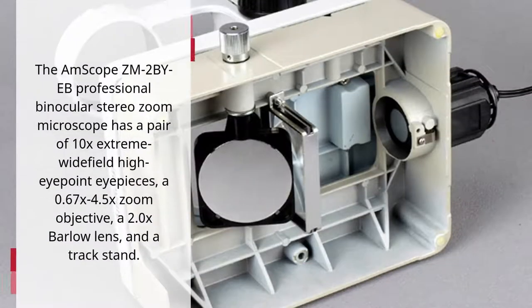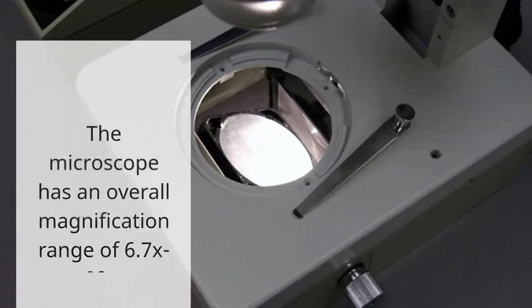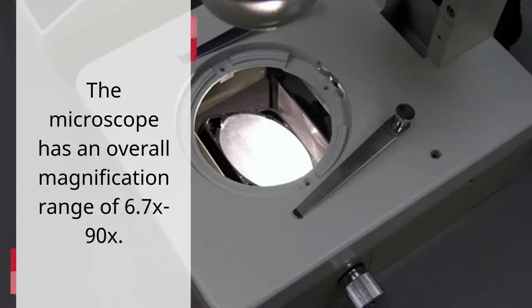The Emscope ZM2 by EB Professional Binocular Stereo Zoom Microscope has a pair of 10x Extreme Widefield High Eyepoint Eyepieces, a 0.67x to 4.5x Zoom Objective, a 2.0x Barlow Lens, and a Trackstand. The microscope has an overall magnification range of 6.7x to 90x.